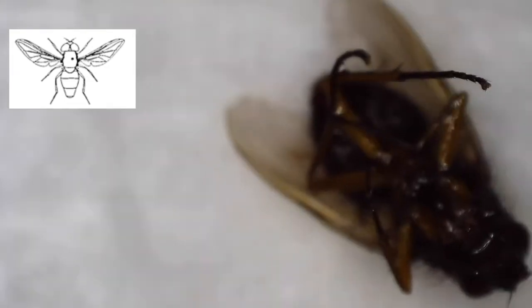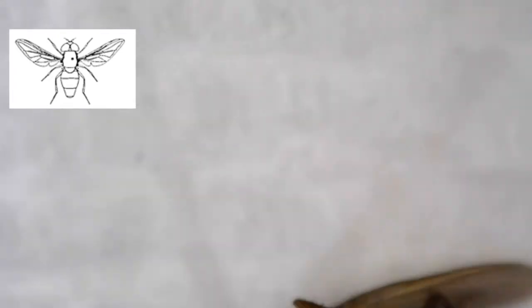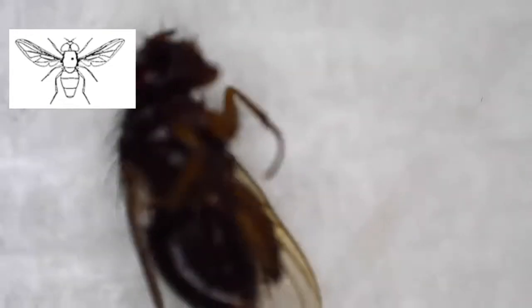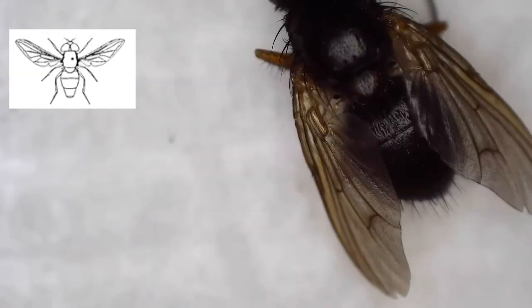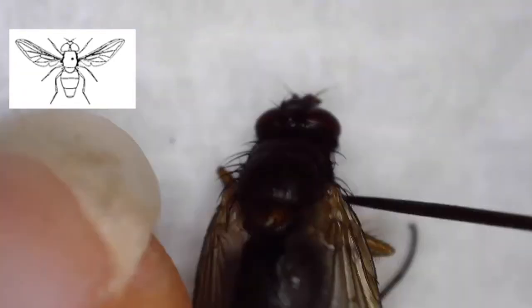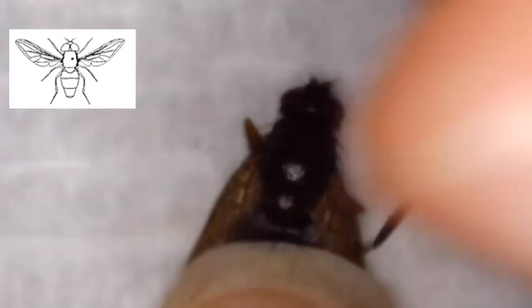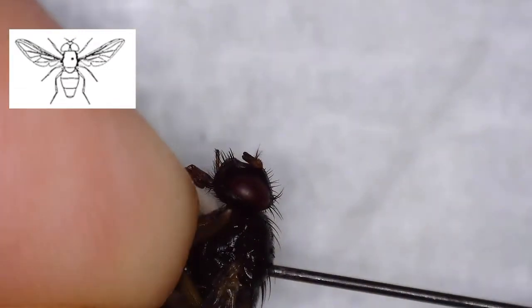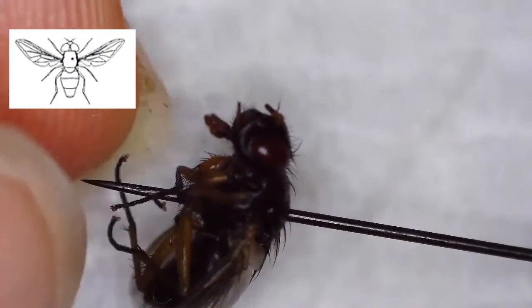Our next insect is going to be one that belongs to the order Diptera, commonly known as the flies. This is another fly that comes out of my malaise trap, so I'm going to get rid of that excess alcohol. It's a very bristly, stout-bodied fly, and hopefully I'm going to point out some features characteristic of the Diptera. Diptera means two wings, referring to the fact that dipterans only have one pair of wings. Things like the Coleoptera, the Hemiptera, the Hymenoptera have two pairs of wings, but Diptera only have one pair.